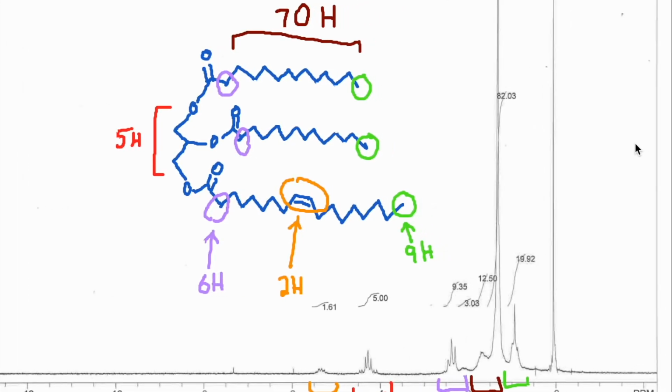All right, let's look at an NMR of what coconut oil might look like. We have a triglyceride here, and I've circled some different areas or different types of chemical shifts that we might expect to see. We have about 5 hydrogens that are on carbons that have oxygens on them. So these would be in about the 4 ppm range. I have it color coded over here. So in this red area, this is a little over 4, between 4 and 4.5 ppm.